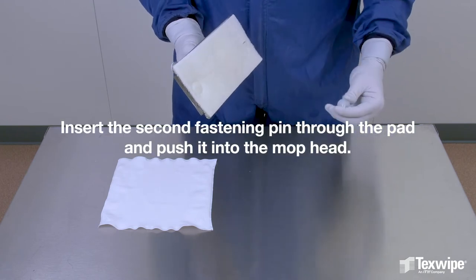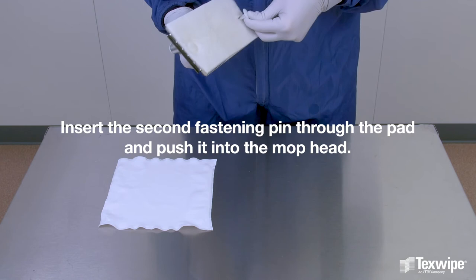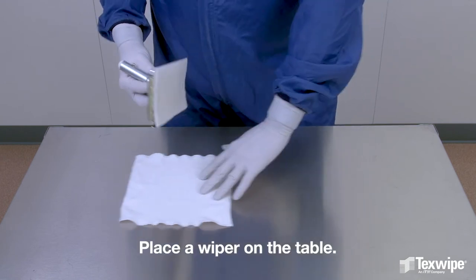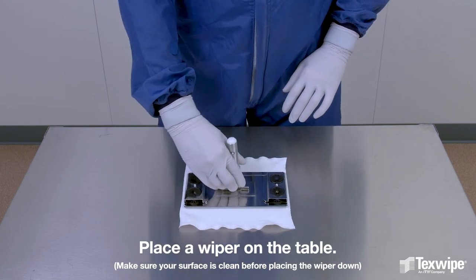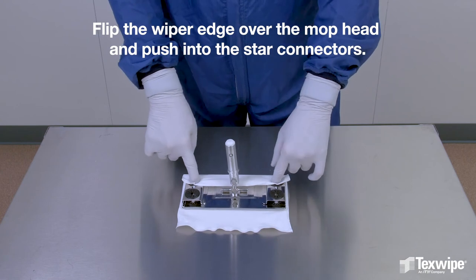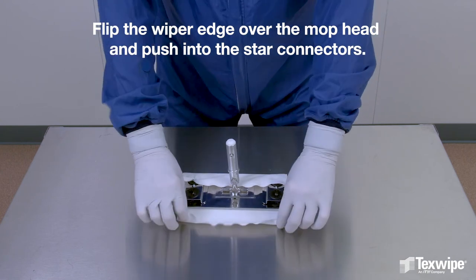Insert the second fastening pin through the pad and push it into the mop head. Place a wiper on the table, making sure the surface is clean before placing the wiper down. Flip the wiper edge over the mop head and push into the star connectors.